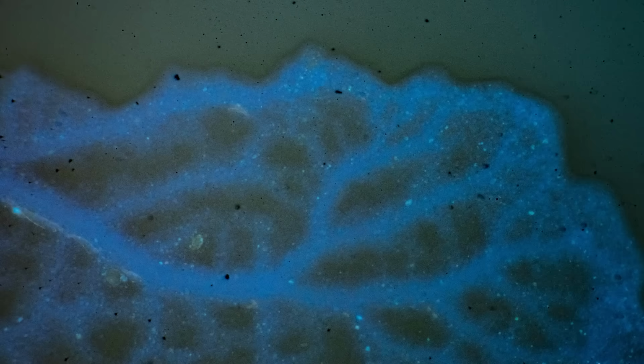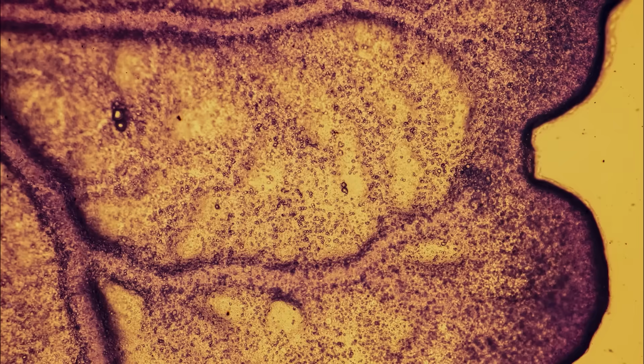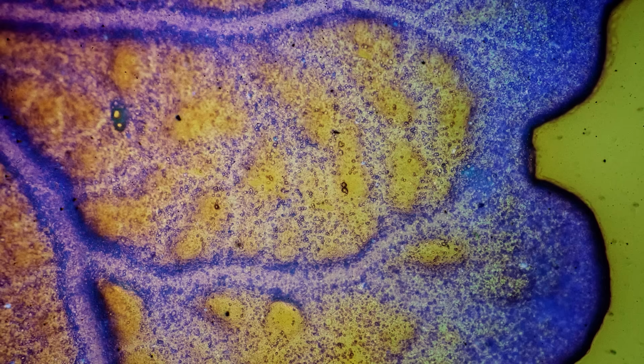I had to take a long exposure as the glow was kinda dim, but sure enough, we see lots of blue nuclei embedded in the non-moving goo, and the veins are glowing blue as the nuclei streak past. I combined a white light and fluorescent image to make this view. We see tons of nuclei flowing in the veins, but are especially concentrated near the growing edge. Though while we're doing this, I have another dye I want to try.